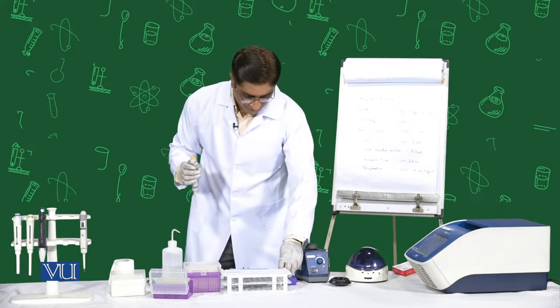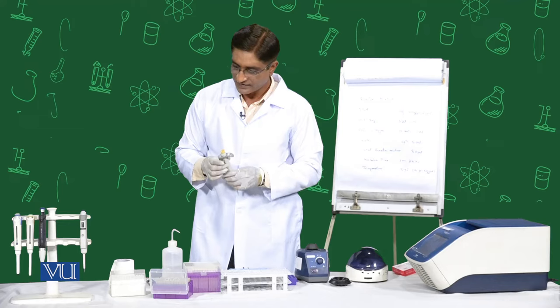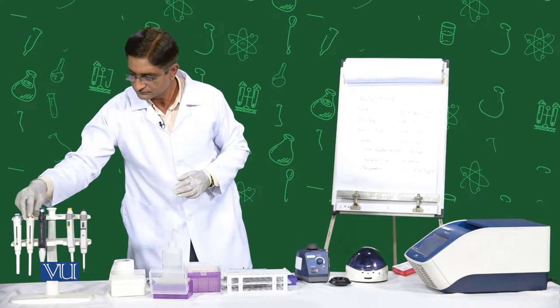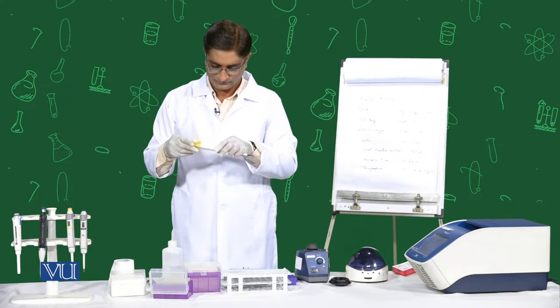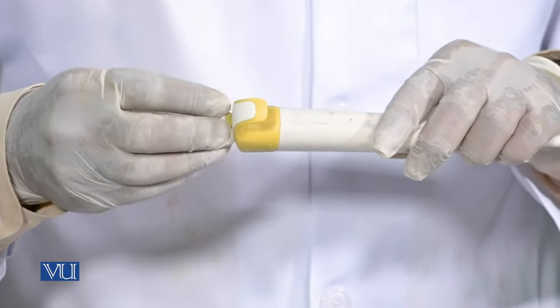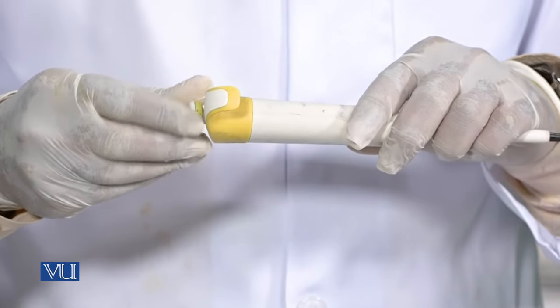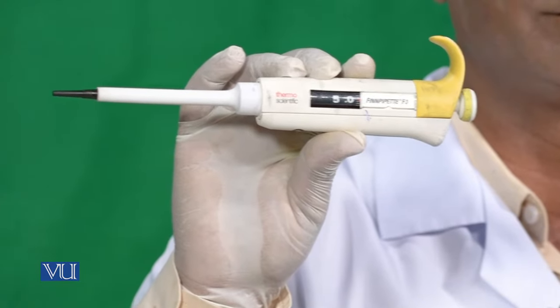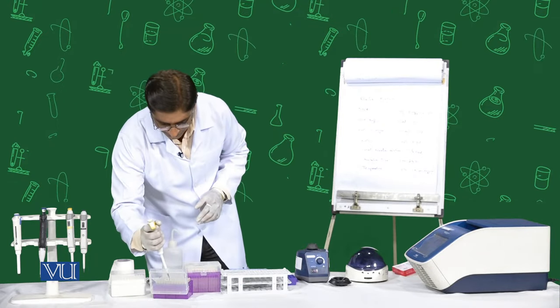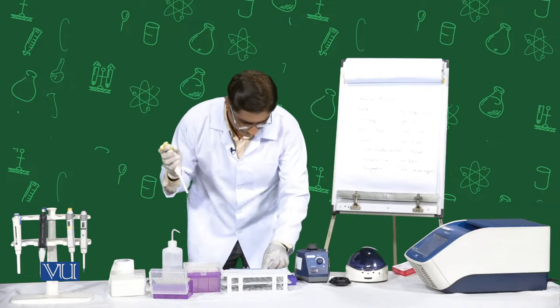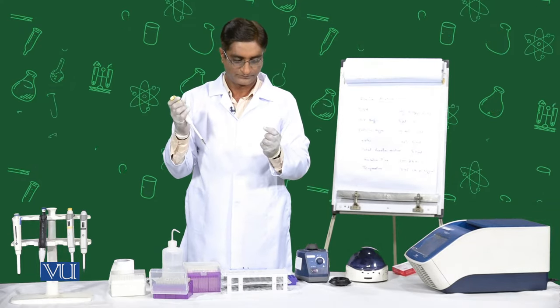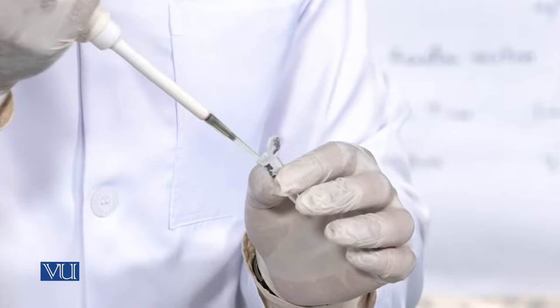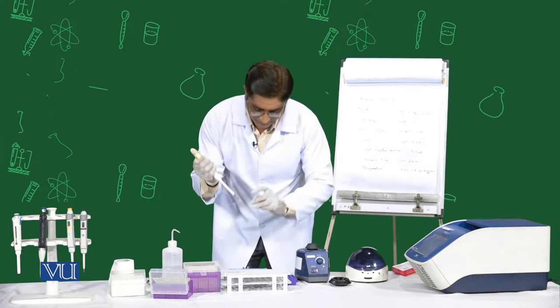After adding water, we will take the DNA buffer — 5 microliters — and I have set the pipette to 5 microliters. This is our buffer. While transferring the buffer, take care not to mix the solutions between tubes.